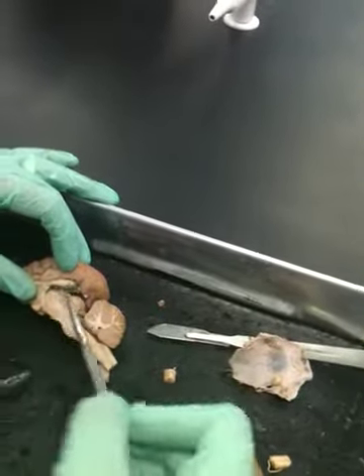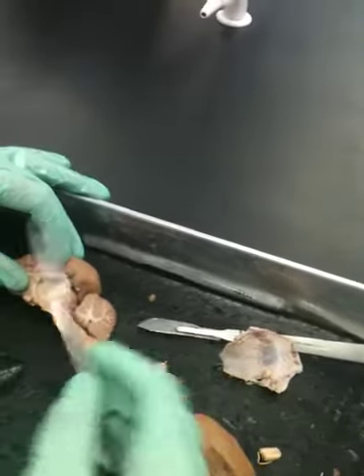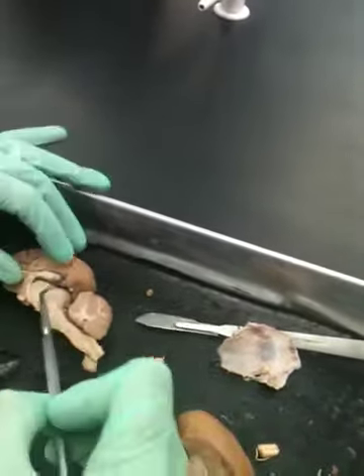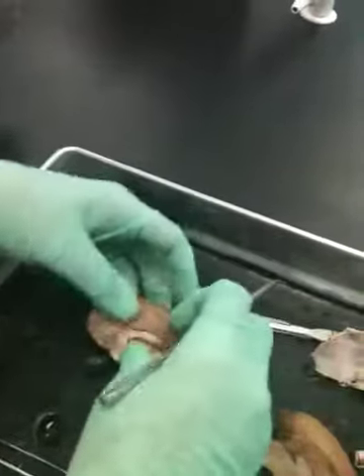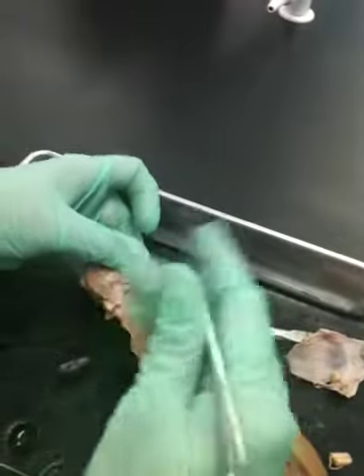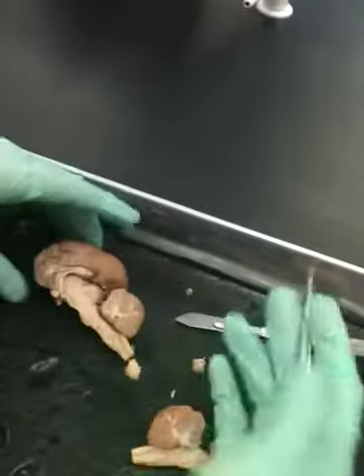Did you say your choroid plexus is in every part of the stuff? Every ventricle has a choroid plexus, whether you see it or not. In fact, if you go digging in there, you usually find it in the laterals. See, there's something. There it is. Okay, so the CSF.